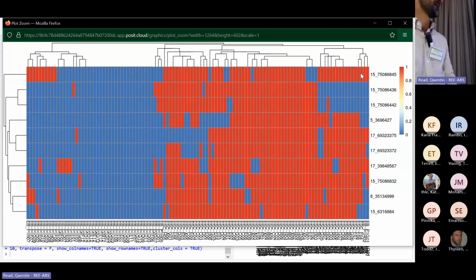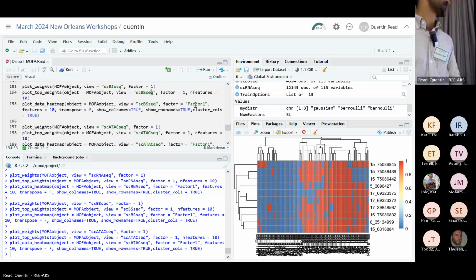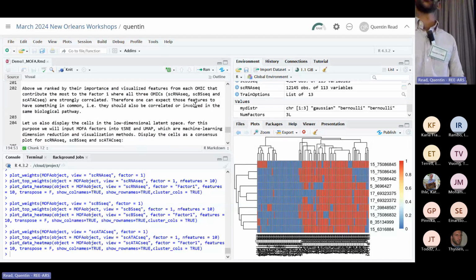Those ones might be sort of anomalous. A lot of the EB cells have zero methylation on all these top 10 ones, and those two are in between. So it seems like the methylation is not perfectly separating those out, because it didn't explain as much variation. The methylation pattern may not be as different between those two cell groups as the RNA-seq expression profiles. Who knows? This is just initial exploration, so it's a jumping off point.